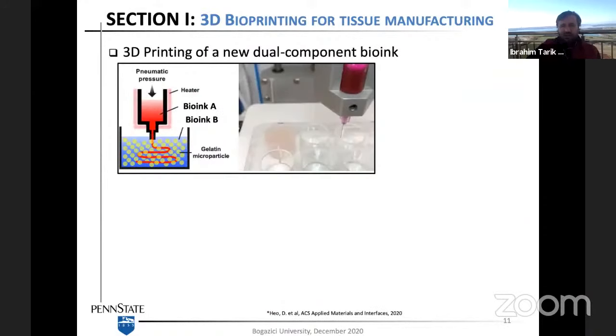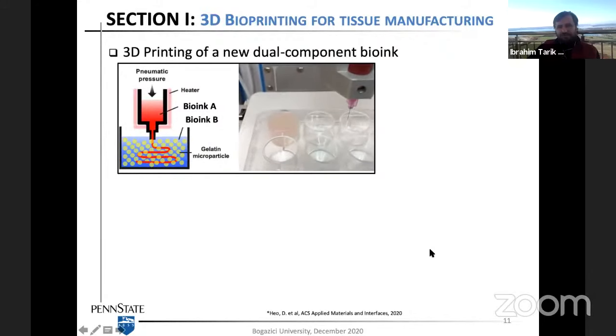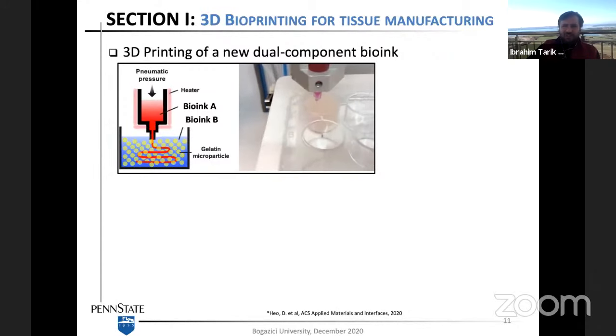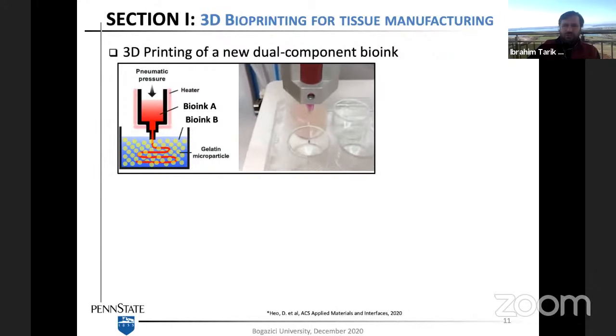In other recent work, we demonstrated bioink development. So the bioink is the material that is used to load the living cells in it. It's a biocompatible material, and most of the time it's a hydrogel-based material that we can synthesize. For example, in a recent work, we synthesized a new material that can cross-link with the material in the support bed. So this support bed here is not really just supporting the printed structure, but it's also facilitating the cross-linking, like the solidification of the printed material with the cells.